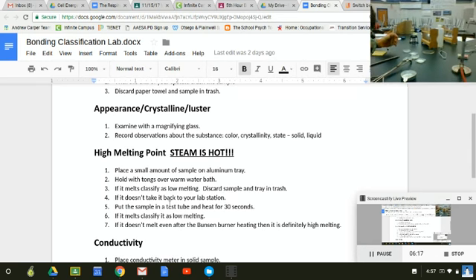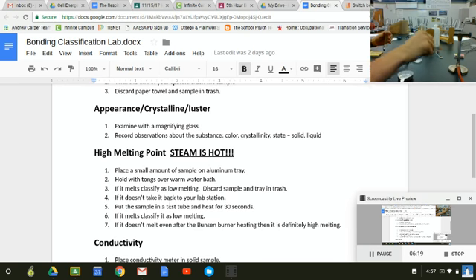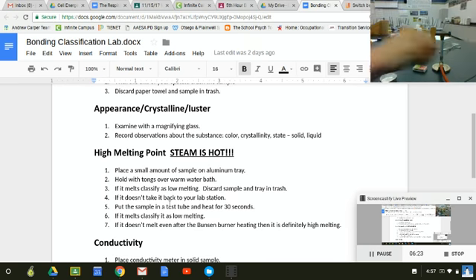So here I have my Bunsen burner, and here I have some matches. And in between my 2 lab stations, there is a beaker for spent matches. Okay, so I have my Bunsen burner here. As you can tell, if you haven't started to notice, it's going to be really important you keep track of what you're doing and labeling test tubes and things like that. Remember, when we light Bunsen burners, we strike our match, then we turn on the gas.